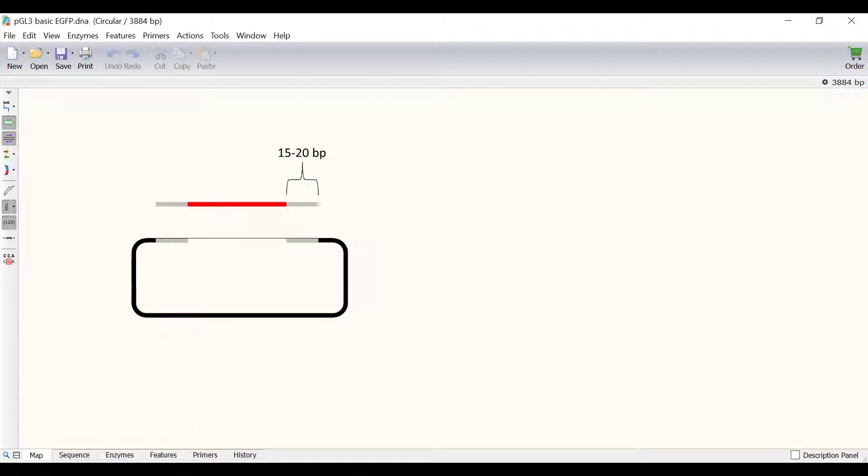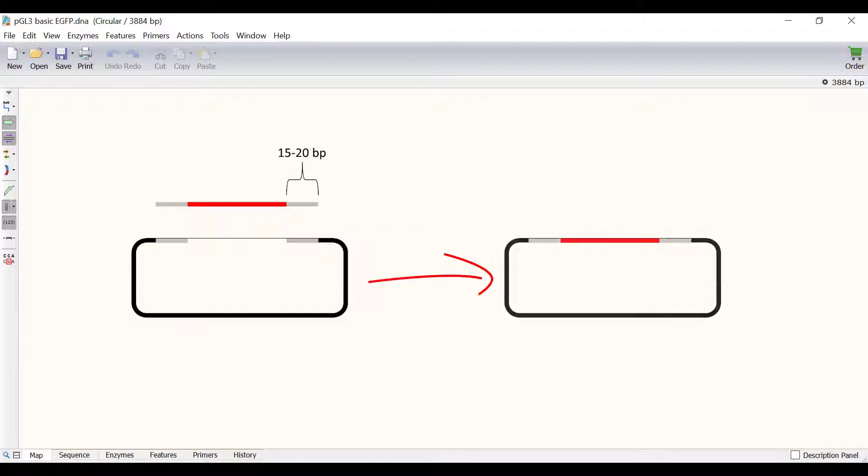Briefly, PCR primers are designed to generate flanking homologous overlaps each around 15-20 base pairs long between the cloning insert and vector. The vector and insert products are then recombined with the infusion enzyme.